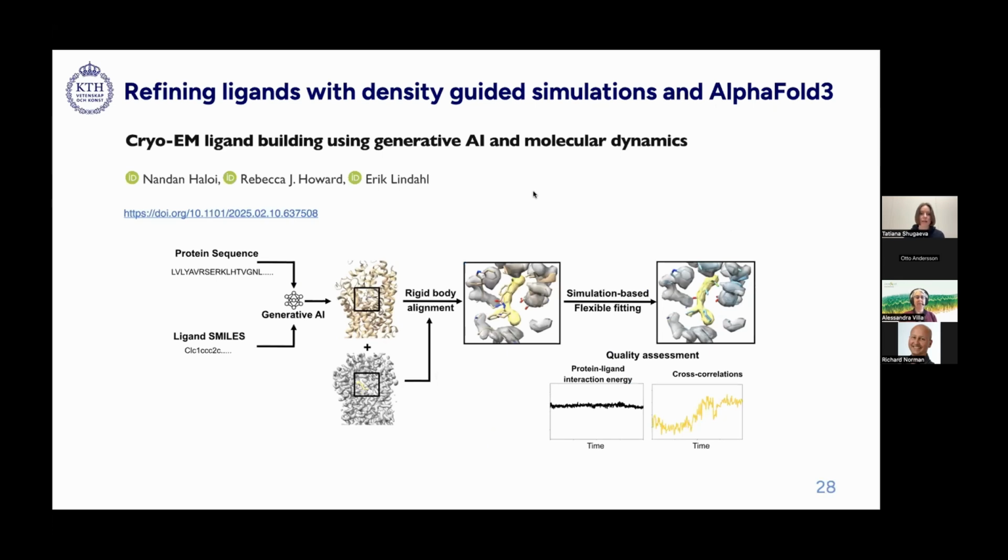And another postdoc from our lab, Nandan Haloy, recently published a preprint where we combine AlphaFold 3 with density-guided simulations for ligand position refinement in the binding site. So also check this out for some practical hints.